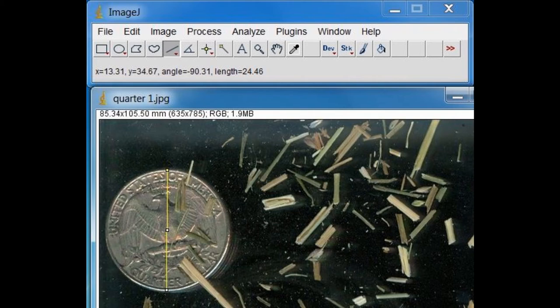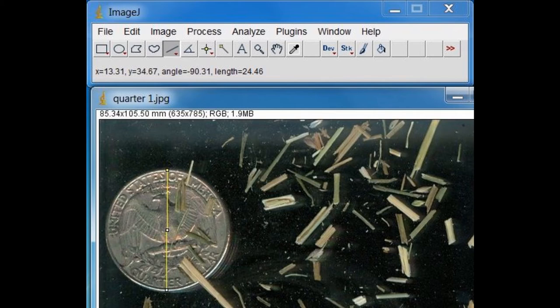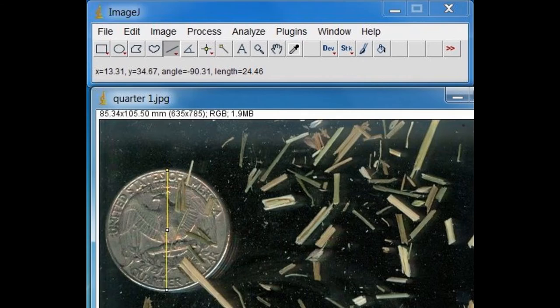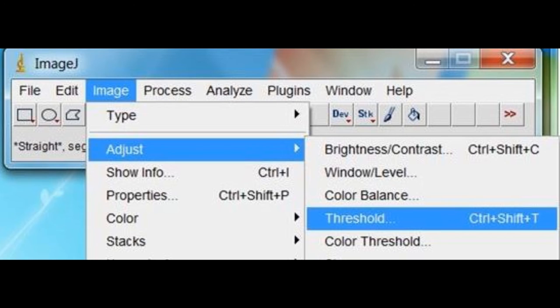Now the threshold range must be set. The ImageJ software requires that the image be a binary image that consists of two colors, so a range must be set so the particles within the range will be one color and the particles outside the range will be another, typically black and white. This is done by selecting Image, Adjust, then Threshold.